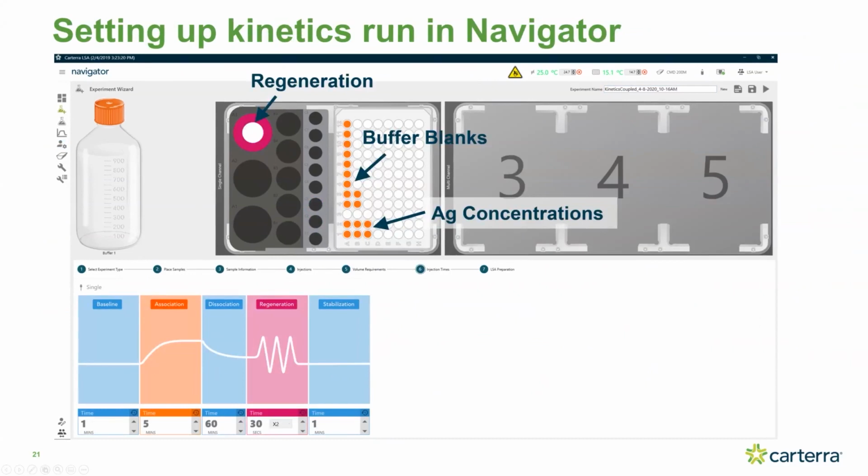These two plate positions up here are for the single needle side, and they hold usually a sample block in what we call Bay 1, and this has positions for 50 ml conical vials, 15 ml conical vials, and 1.5 milliliter vials. And then there's a microplate position. Here we have a microplate that has wells that contain each of our 2 antigen concentrations for 3 antigens and a bunch of blank wells for doing the blank injections.